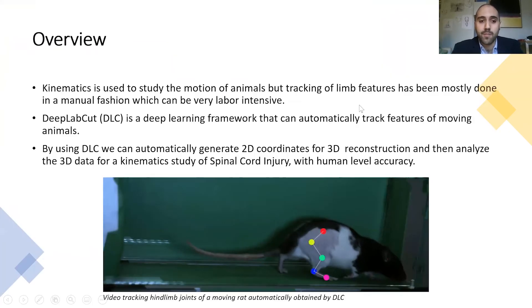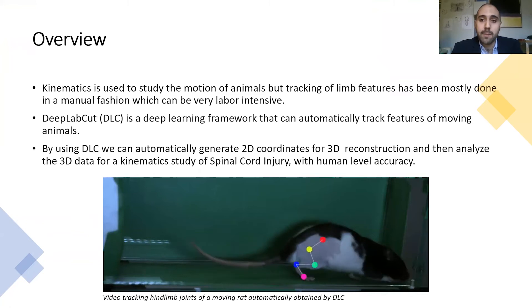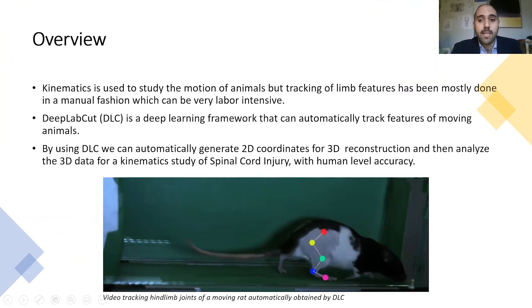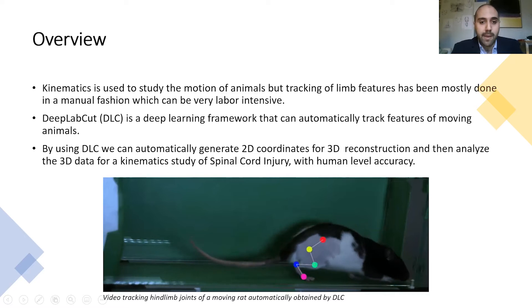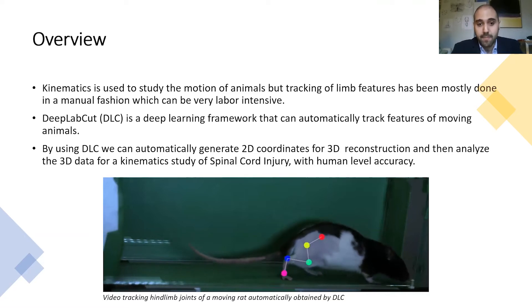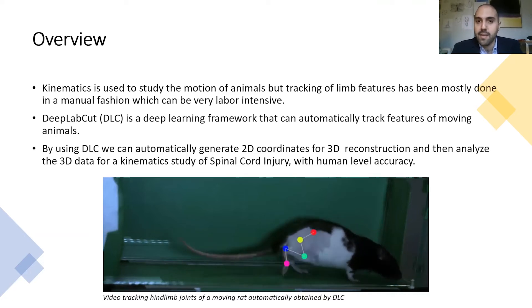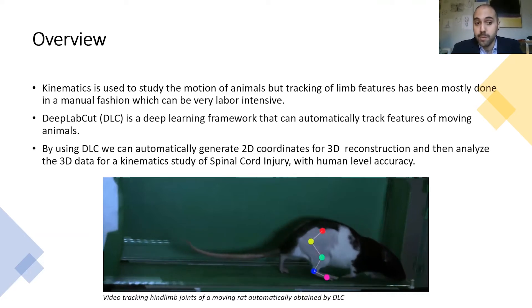As an overview, kinematics is used to study the motion of animals, but tracking limb features has been mostly done in a manual fashion. This can be very labor-intensive and very time-consuming.